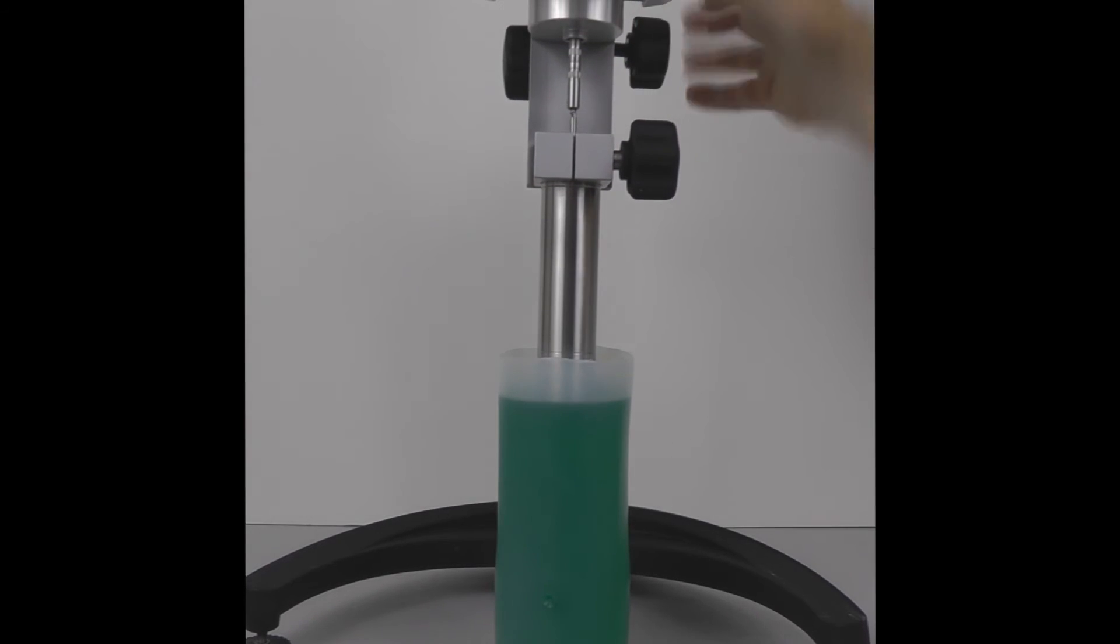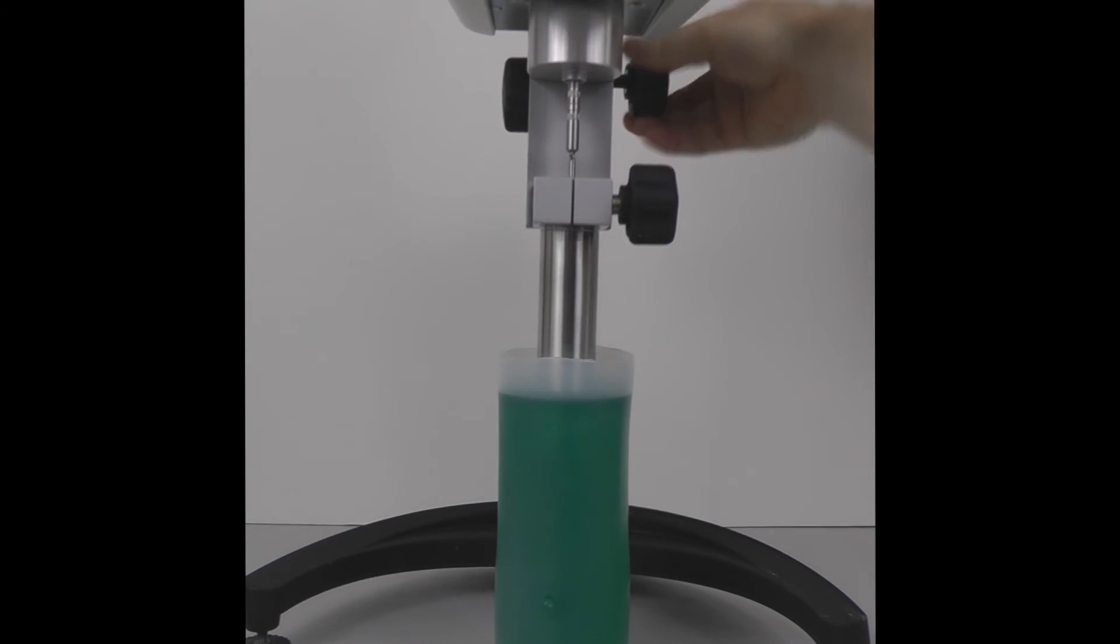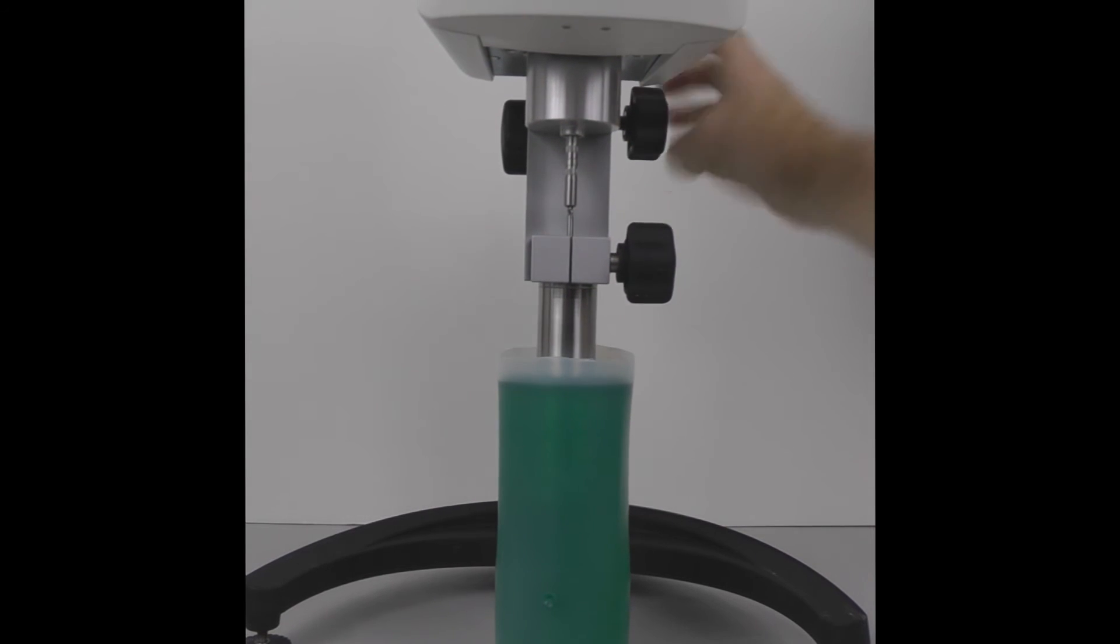In an open tube system, the water jacket and end cap are removed so you can directly submerge the ULA into a sample container.